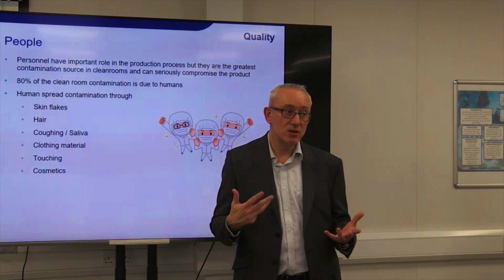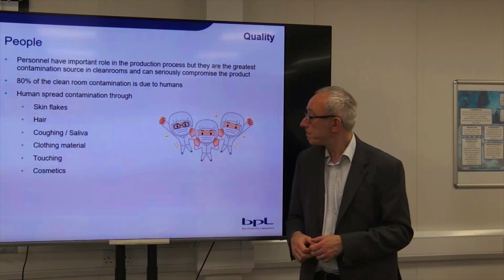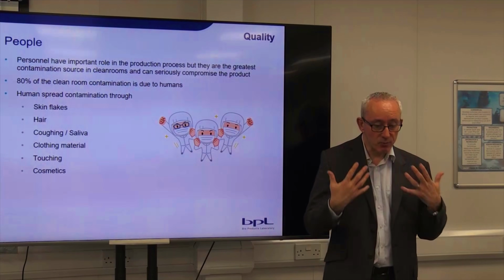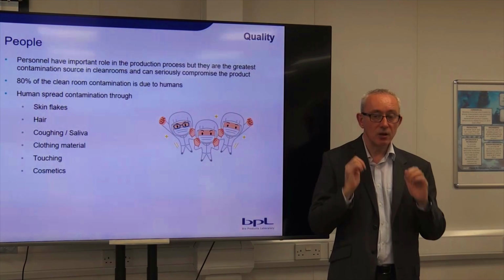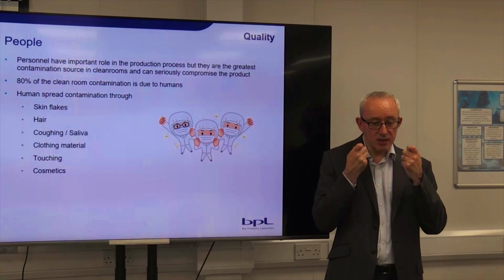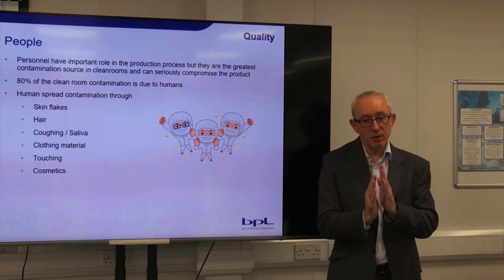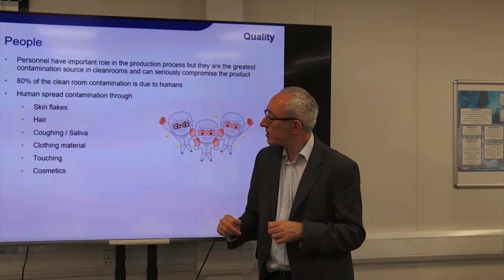So we saw that we can sometimes lose 150 hairs a day. Another big one is coughing, and also the way that saliva is produced. So although the critical operations involve wearing a mask, if someone is coughing excessively, then the ability of that mask to keep contamination in is reduced, because if the mask starts to become wet, its ability to work as a filter decreases.